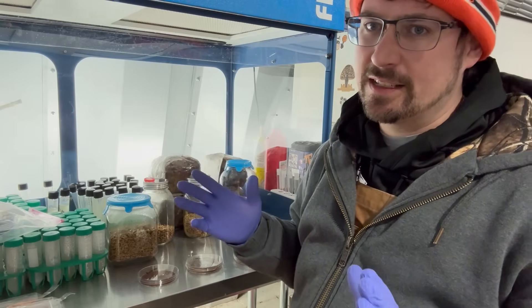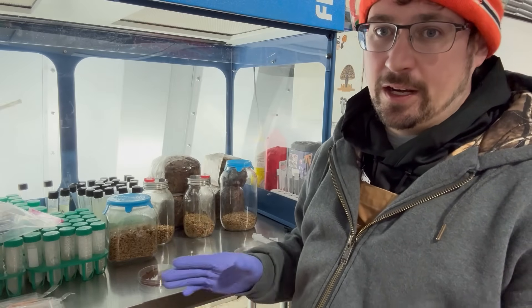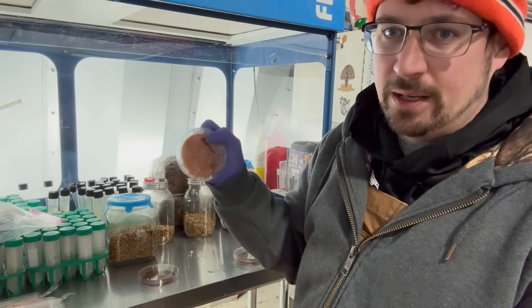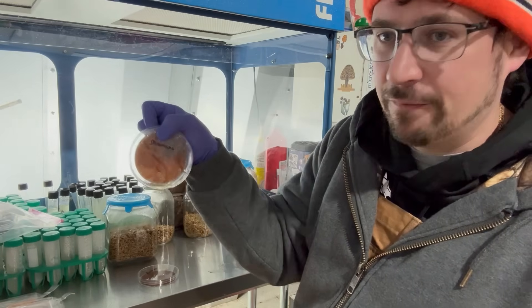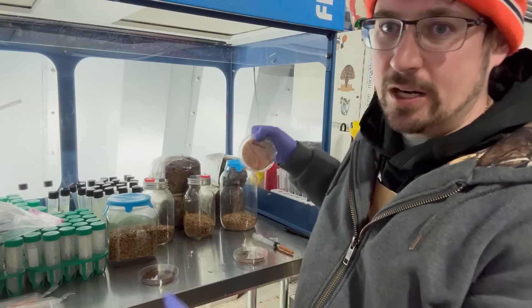Anything under 10 is good. 10 to 30 means you may need to change a filter, and anything above 30 means you need to address whatever problems are going on in your room or with your flow hood. I'm definitely impressed with this little flow hood, the Shrew Magic. Go get yourself one if you're looking for a starter or just don't have enough space for a larger flow hood.